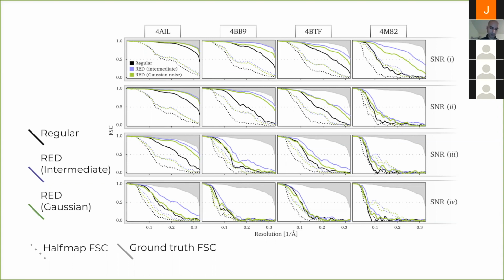Do you mean in the preprint, or do you mean here now? Here. Oh yeah, so you can refer to the preprint where we specify exactly all the different blocks that we use. It's a UNet. I don't remember exactly the name. I mentioned that there's a lot of room for improvement on the network. So initially, I just picked a type of denoiser. It's a UNet that is called a residual.